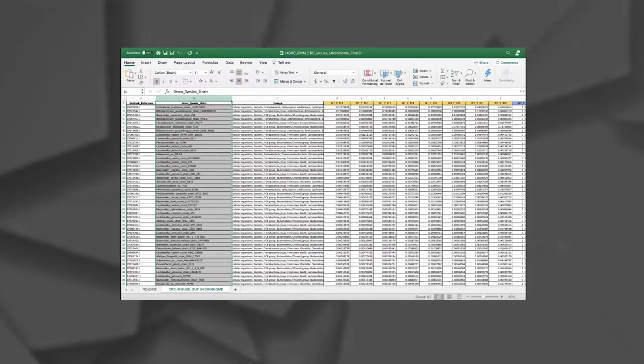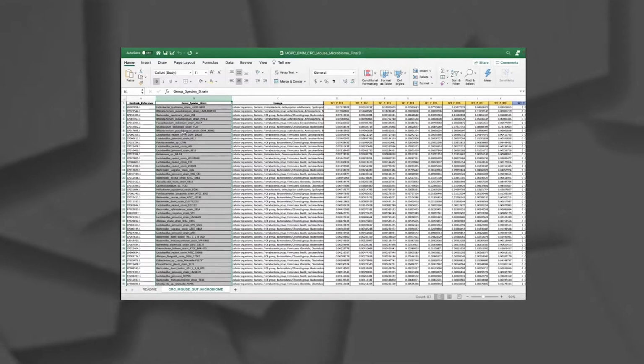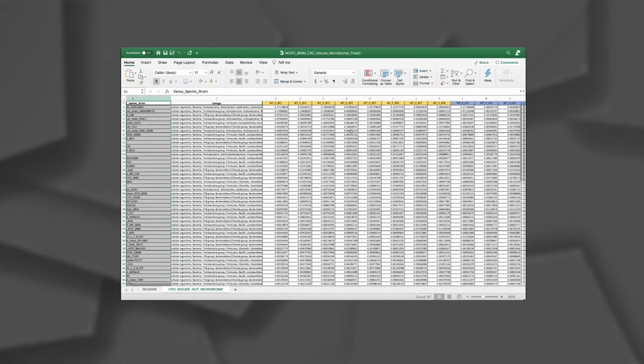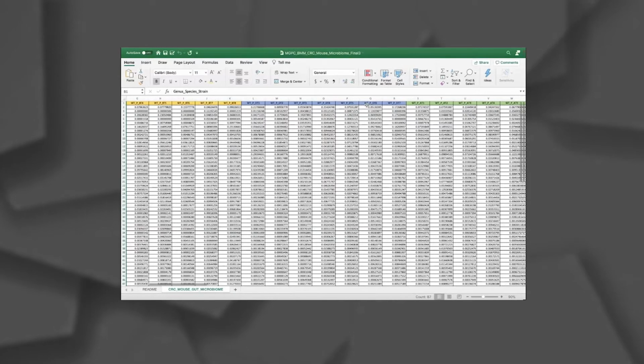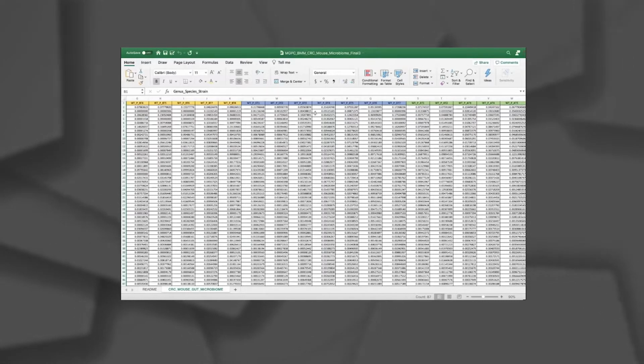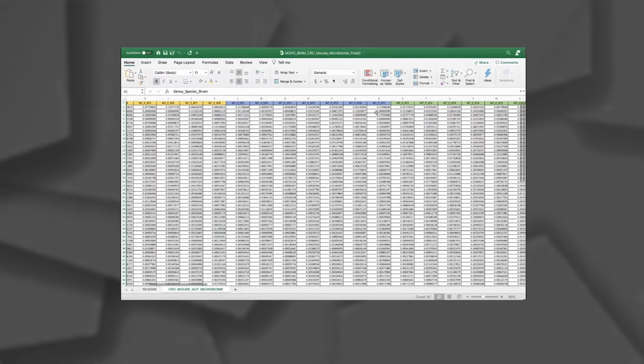Because we want to answer a specific question, is there any signal differentiating between TGF beta deficient mice and wild type mice before treatment? We only want before treatment mice. So we're going to actually remove all data that was taken during treatment and after treatment. The DTs stand for samples collected during treatment, and after treatment is AT. So we're going to delete those samples, the wild type during and after treatment, and then we'll delete the TGF beta during and after treatment samples.